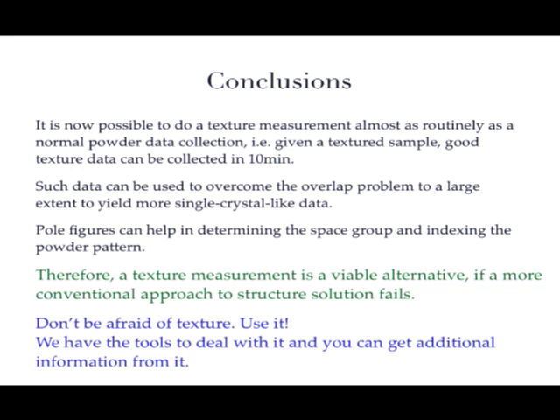Well, I think that one was probably done just sorting the angle. So it's actually depending on the instrument. You are just taking the angle in a so-called equal area space on the pole figure. In the plot it seems random because with the new instrument, you don't measure really the point where they are.